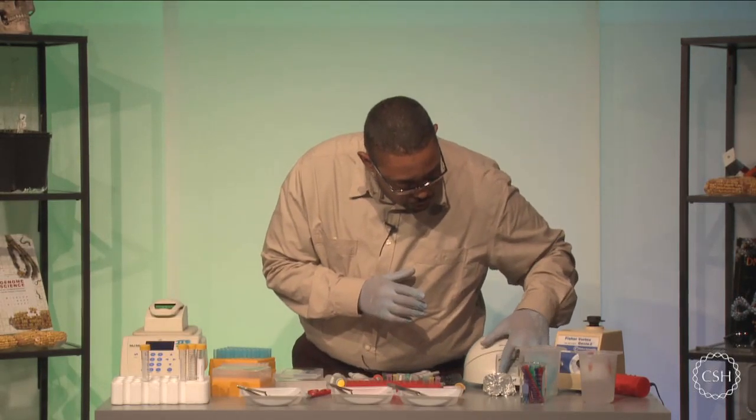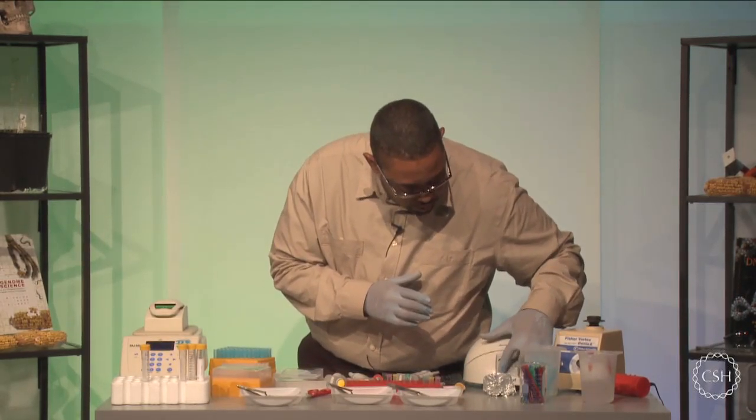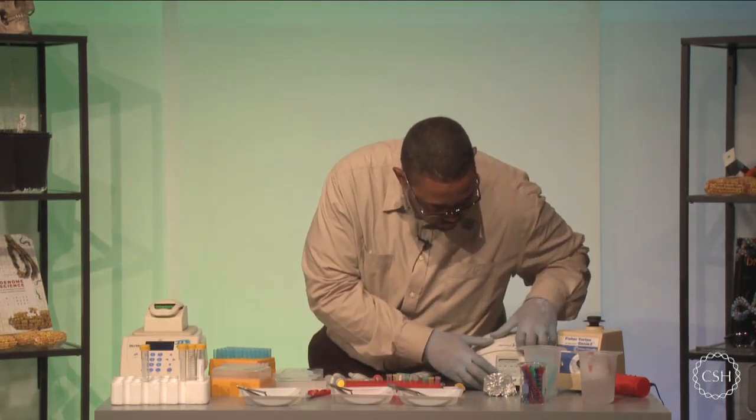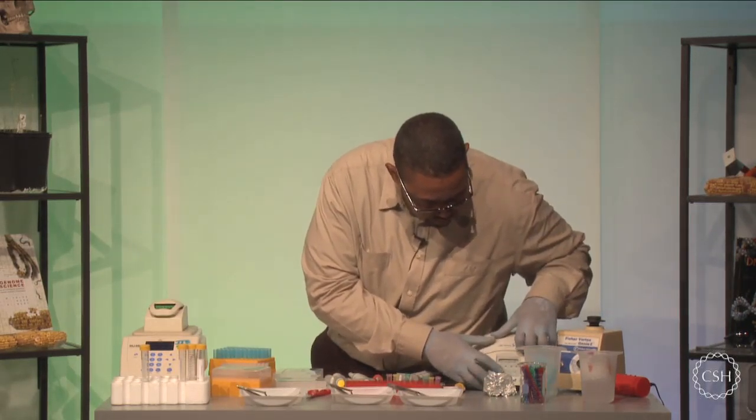At this point, you're going to want to spin your sample. And this last spin is going to ensure that we have, hold on one second.